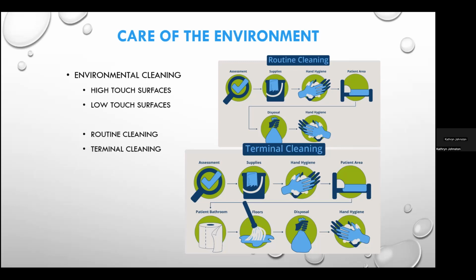And when we talk about linens here, it doesn't necessarily mean bed linens, but it could be other healthcare associated textiles. So this could include lab coats. This could include cotton towels that might be used in the laboratory, or other components like that. So it's important that the persons who clean in the laboratory have been educated, and we're going to talk about that in the risk assessments.